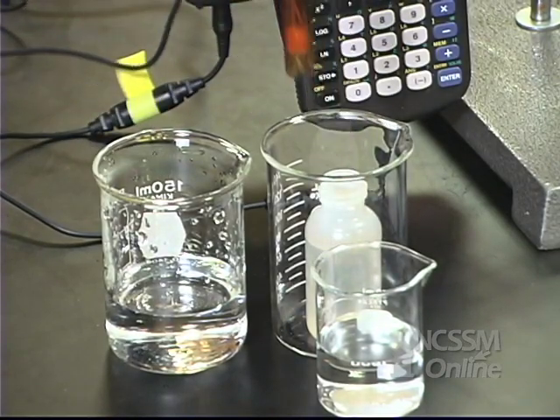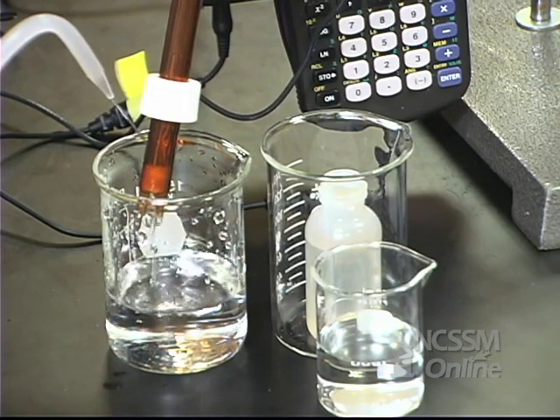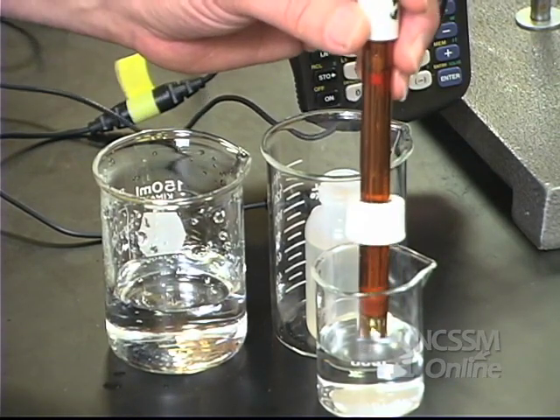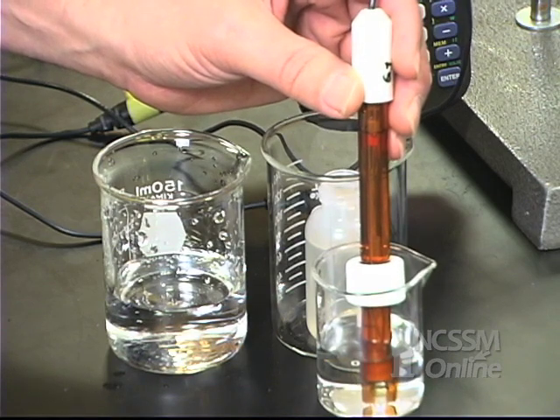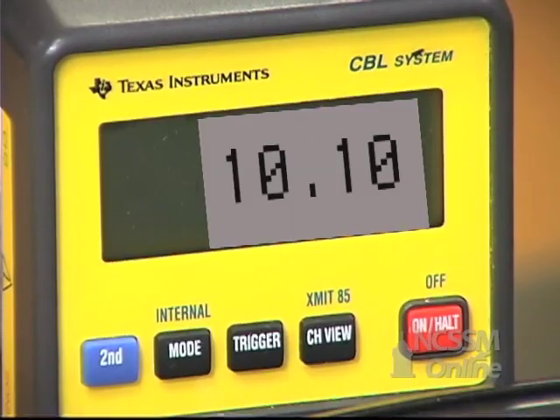We're going to take our pH probe out of the storage solution and put it into a saturated solution of magnesium hydroxide. We're going to read the pH off the CBL.